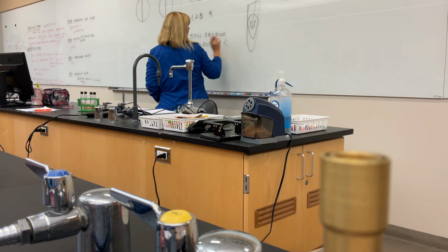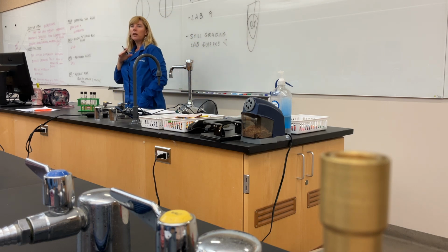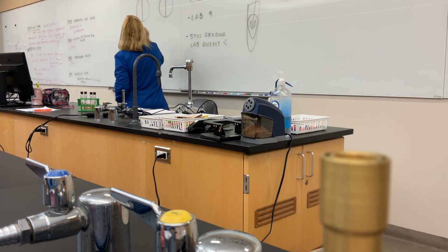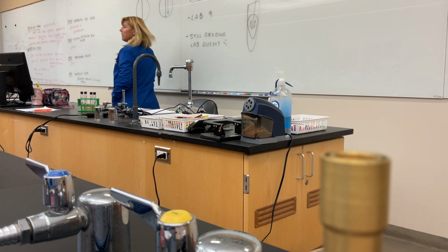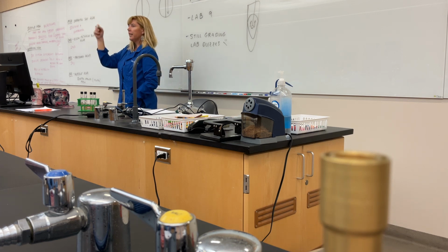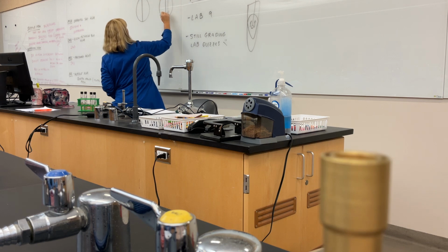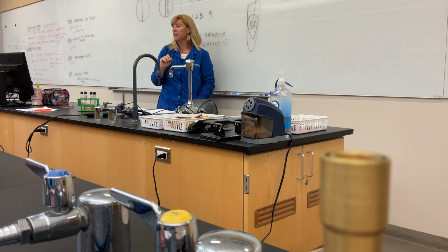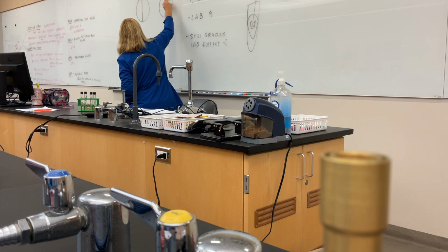So what I'll do then is once I've picked up that bacteria, I'll come over here and do what's called a fishtail streak. So I'm going to take my loop and streak down on the plate. That's my first streak. And then I just take the loop and go back to the top. I'm not re-inoculating. I have enough bacteria, so I scrape down. And then with the same loop, I just come here and I zigzag. So it's called fishtail. All right? And you can spread it out a little so that you get a little bit bigger of a swipe.